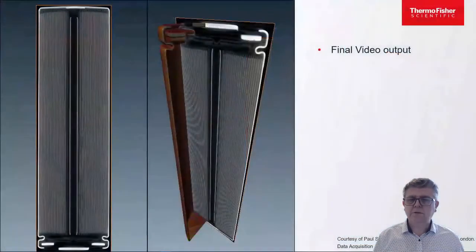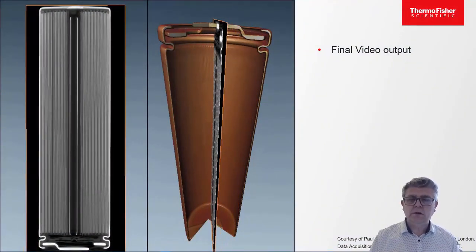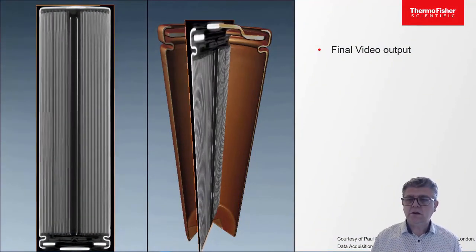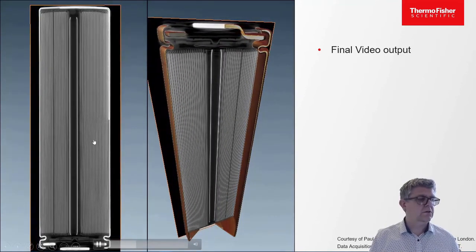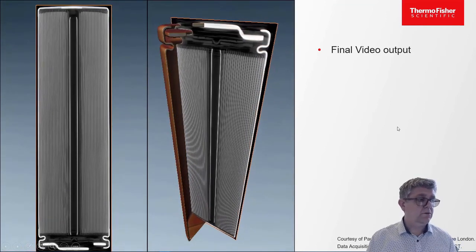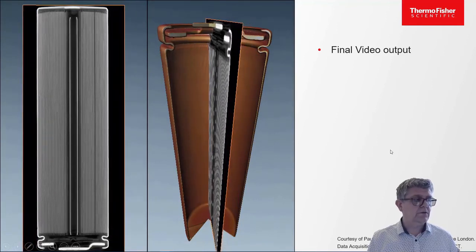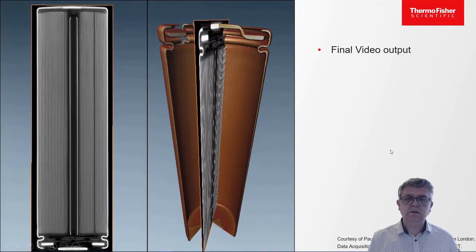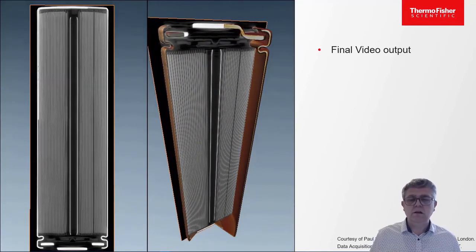So let's see the final result of my video. Here you are. It's a rotating slice, and you don't see any loss of quality here. The volume render is probably rendered at lower quality, but it's not visible. So you have to be smart in a way. With advanced LDA expert settings, it's fine.